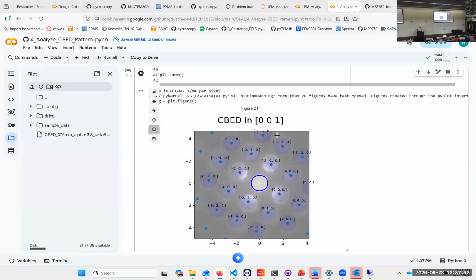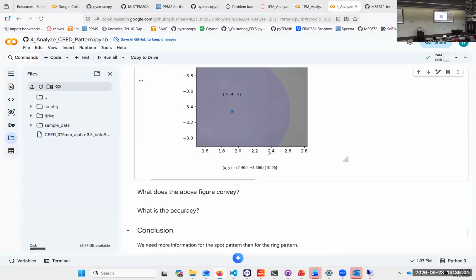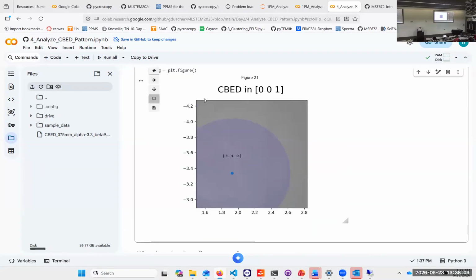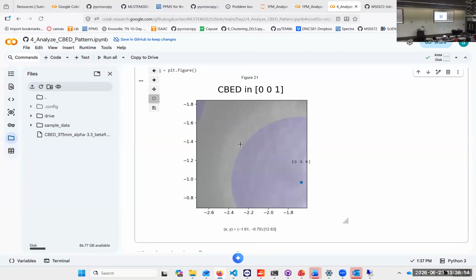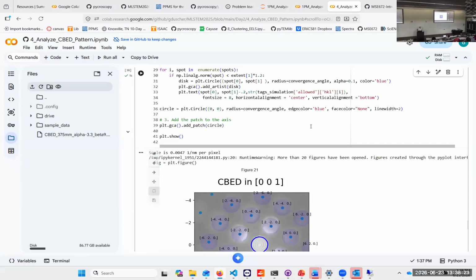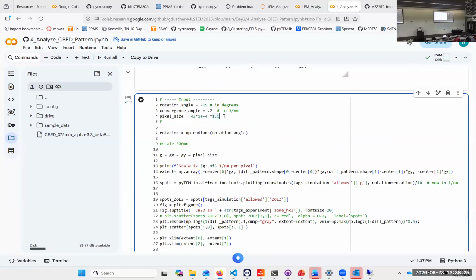So what you really want is one that you still see and has a relatively large angle. Okay, this one we don't see very nicely. So you want to have the largest angle that you can discriminate, and then you have this disk. There are different ways to do that otherwise, if you want to do it by hand. Okay, now let's go 5%.